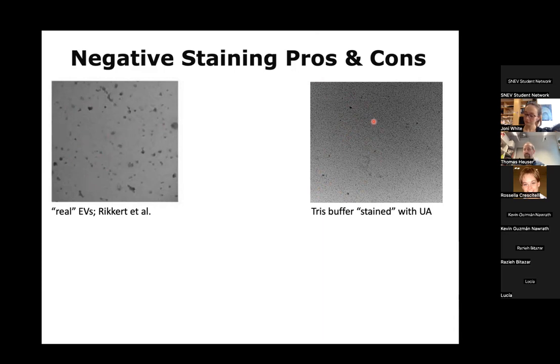And this is the big downside of electron microscopy. It's almost like coffee ground reading, because in the end, your sample dries out, and every solution, unless you have very pure water, every buffer, every other solution will have some salts, some soluble components in there, and they will eventually crystallize and fall out. And these are the structures that you see here.